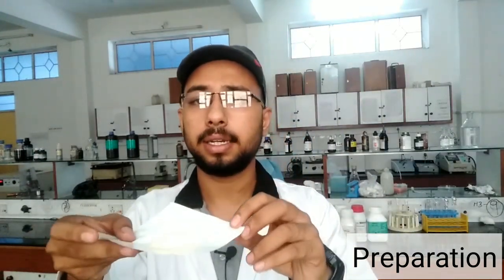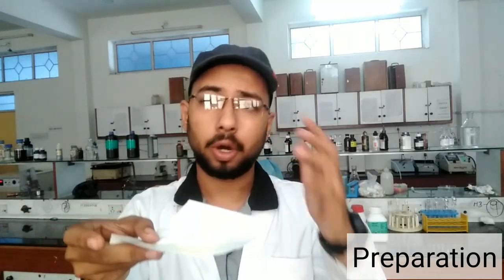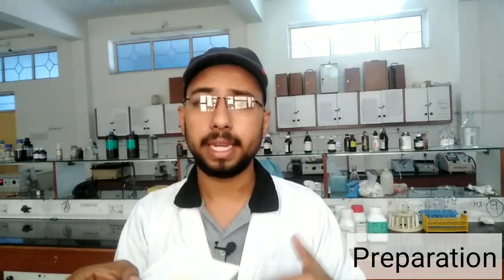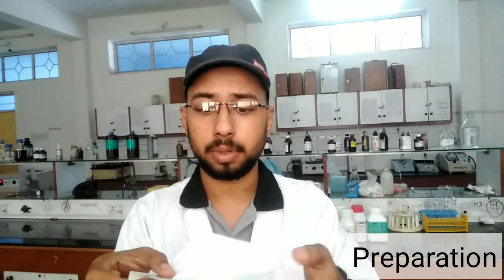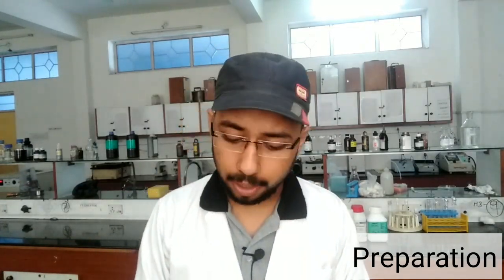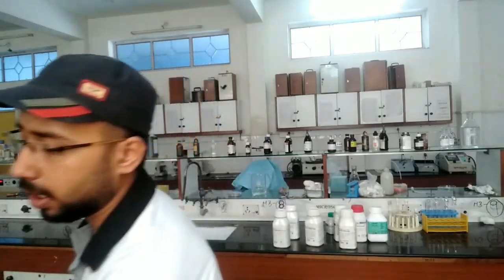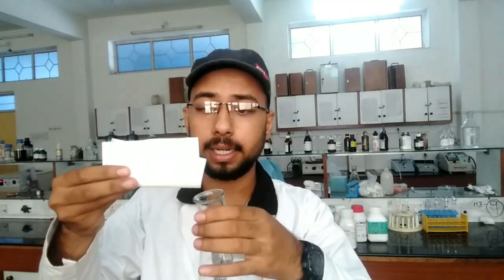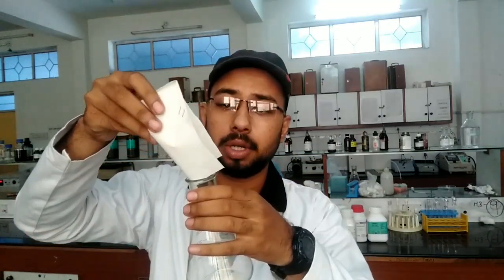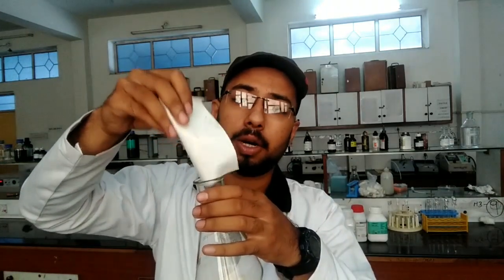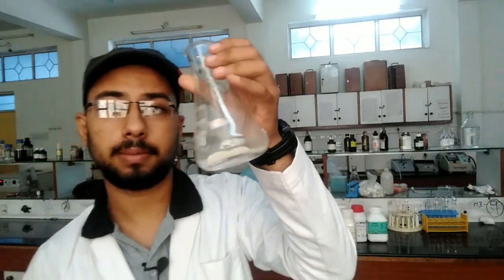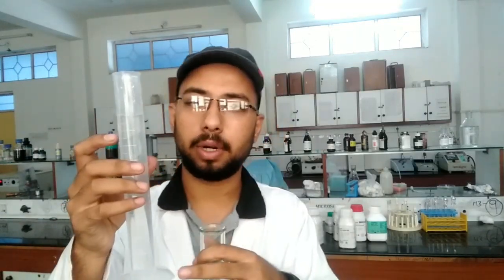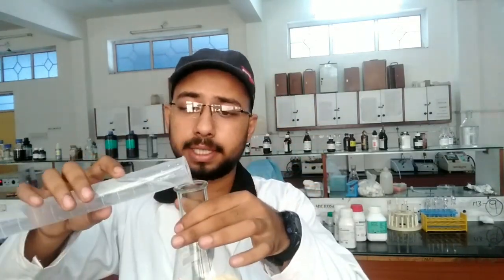Weigh out the blood agar powder on butter paper — butter paper is recommended for weighing culture media. Now take a properly cleaned conical flask and add all the blood agar powder into it, then add 100 ml of distilled water and mix it properly.